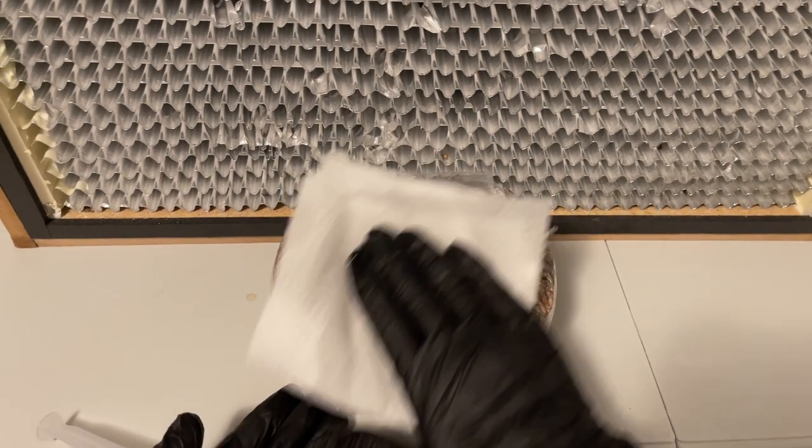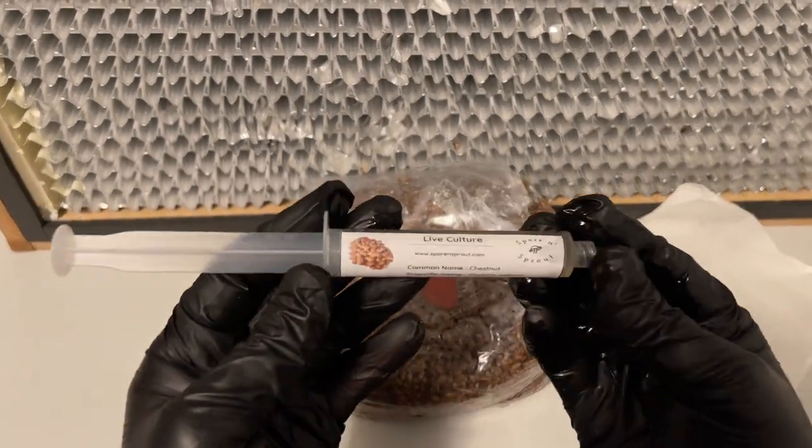The next step is to inoculate your sterilized grain spawn with chestnut liquid culture.